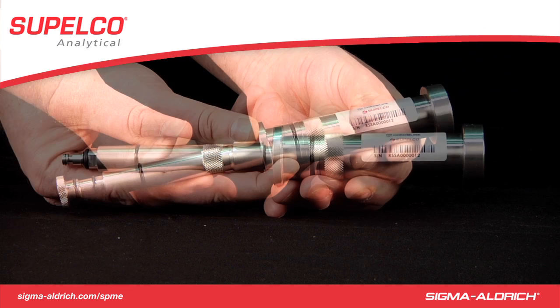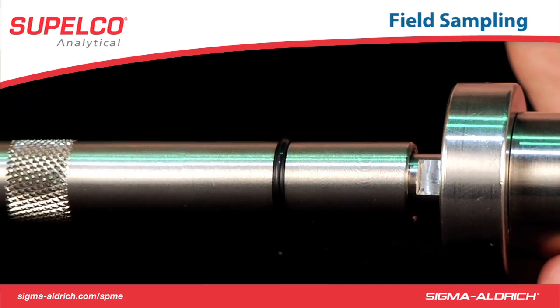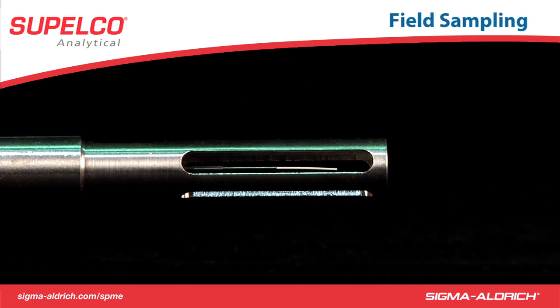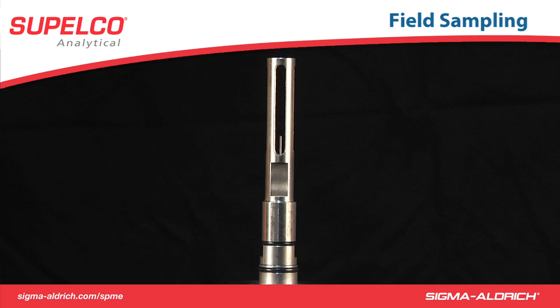Upon arrival at the sampling site, remove the plunger cap and take off the plunger. Place the cap in the storage opening of the plunger and attach the notch of the plunger to the back of the holder. Expose the fiber by pressing down on the plunger. During exposure, the fiber is surrounded by a needle protector preventing breakage by mechanical impact.